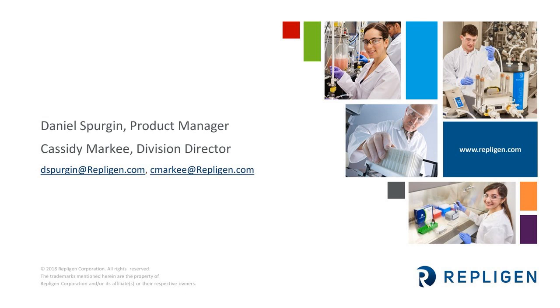Great. And for viscous polymer solutions to remove small contaminant, can you discuss the pros and cons of this technology along with TFF?